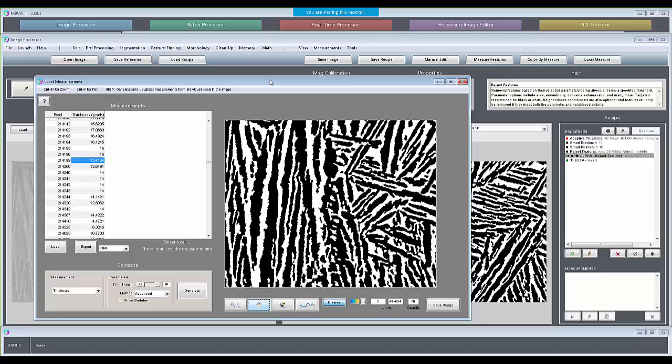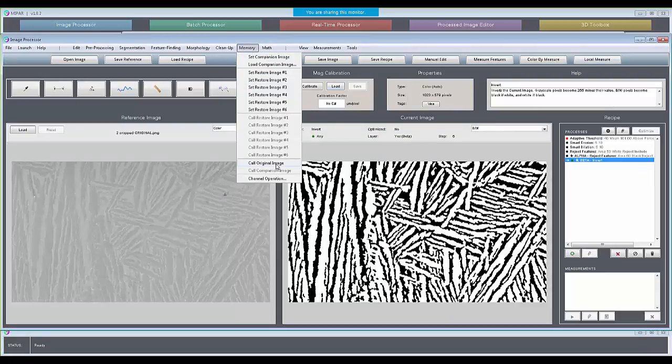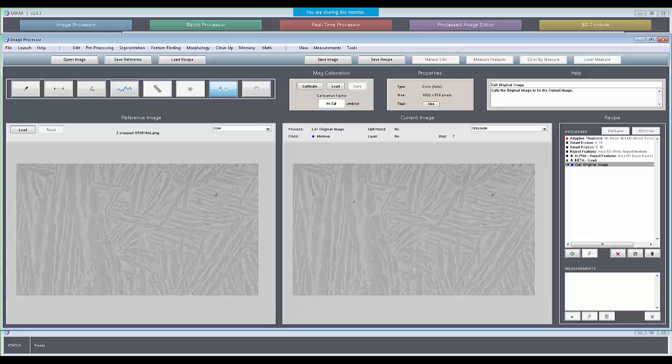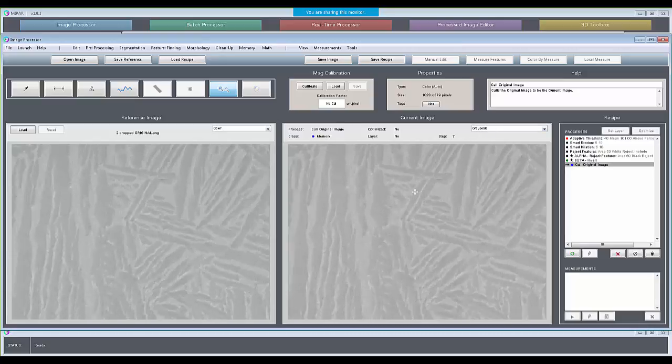Now, prior to digital image analysis, prior to computer-aided image analysis, it was the norm to take your micrograph here, and put down either a regular or a random grid of 10 by 10 points, something like this.